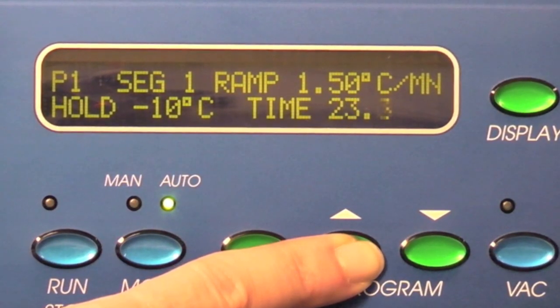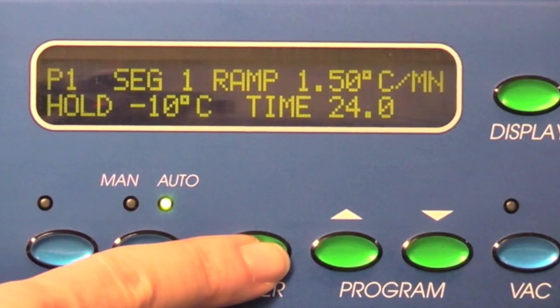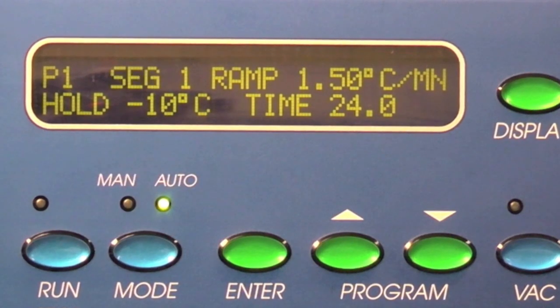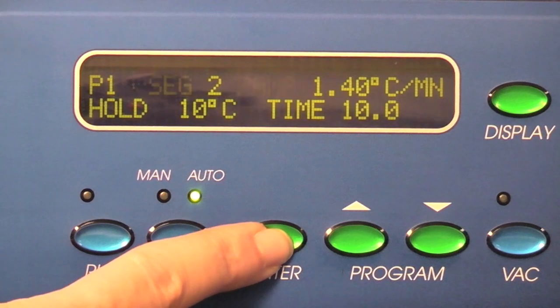Press enter to store the parameters and advance the cursor until SEG is blinking. Use the up button to get to SEG 2.